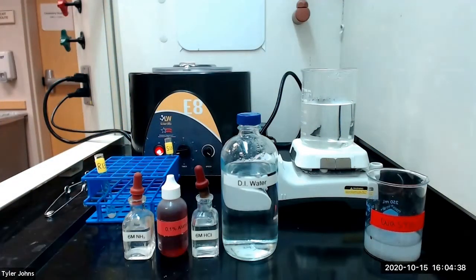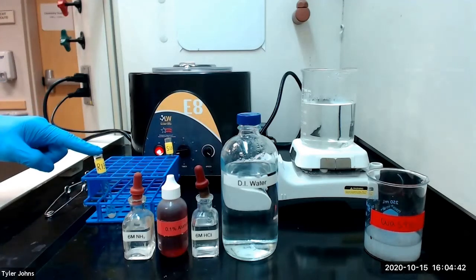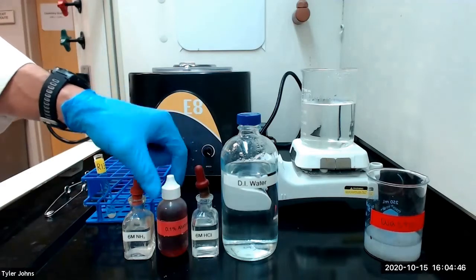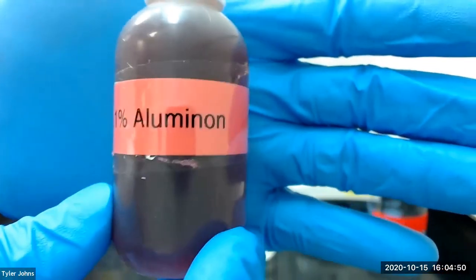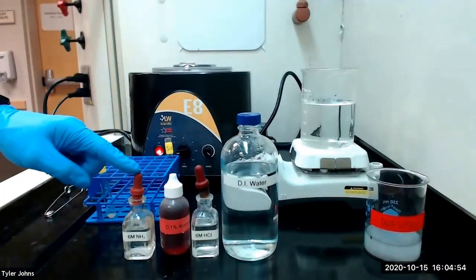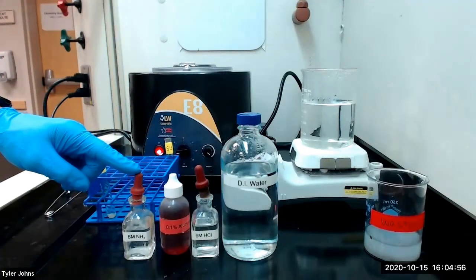We will now confirm the presence of aluminum ion. We will dissolve residue R13 in one milliliter of six molar hydrochloric acid. We will then add two drops of 0.1% aluminon reagent. We will then make the solution faintly basic with the dropwise addition of six molar ammonia.